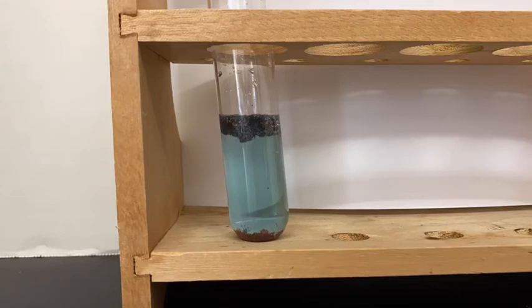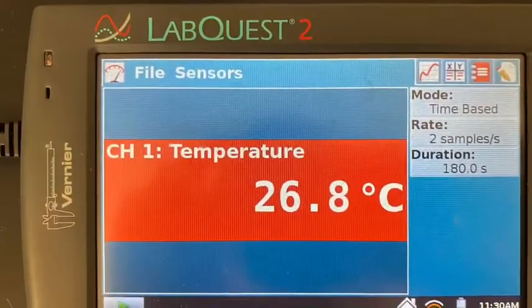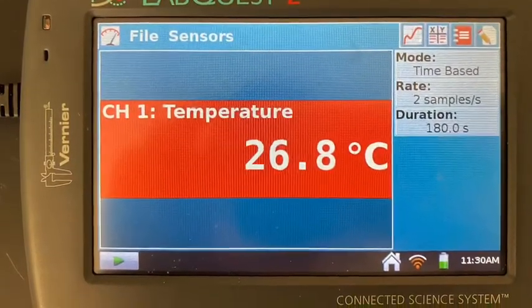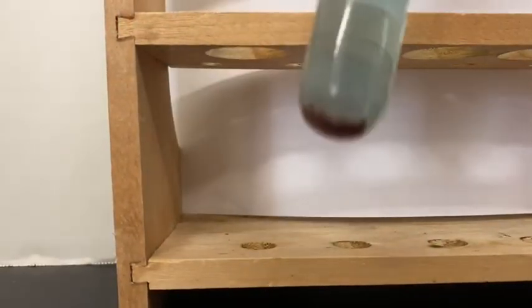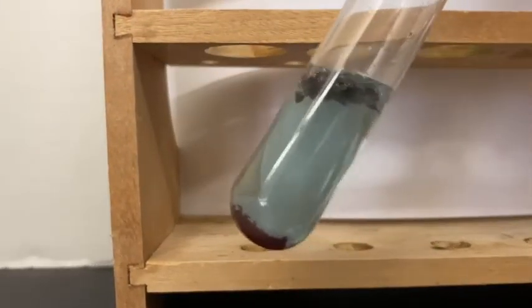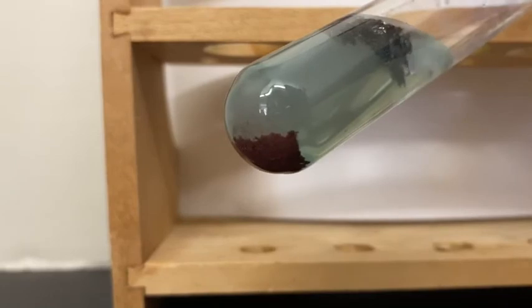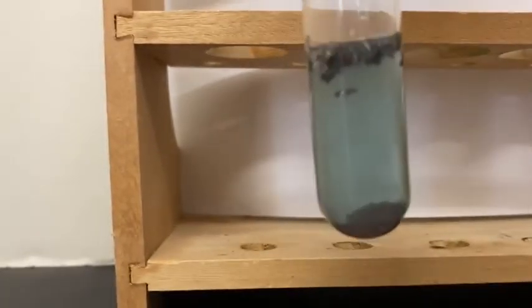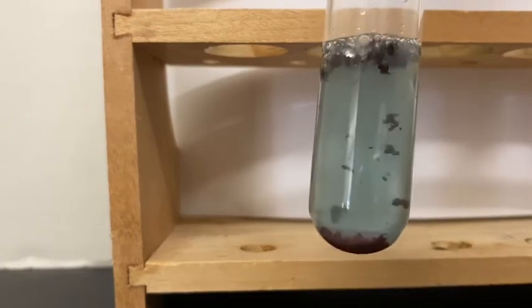Back to our time lapse. Give it a stir. Now that the reaction is over, this is our final temperature. You can see that the sediment on the bottom is a reddish, brownish color. Not all of the aluminum foil reacted — we had some excess reagent there. But you will notice that the solution changed color a bit.